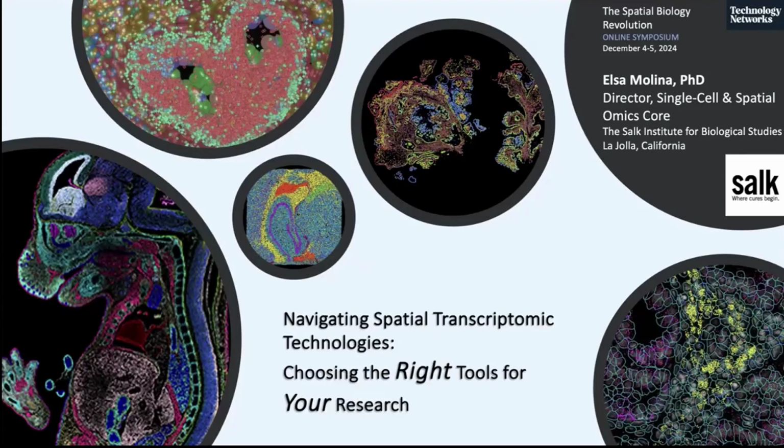My name is Elsa Molina, and I have been leading the single cell and spatial omics core, formerly known as the Next Generation Sequencing and Genomics core, here at the Salk Institute for more than 2 years. The goal of this presentation is to provide you with as much information as possible to help you determine which spatial transcriptomic technology is best suited for your project.